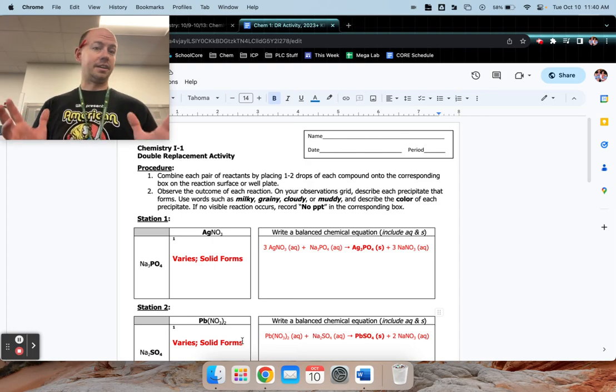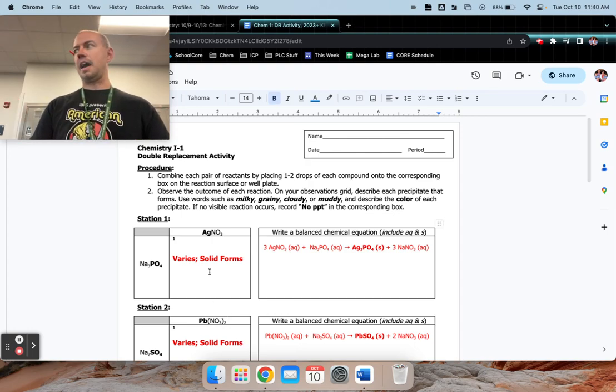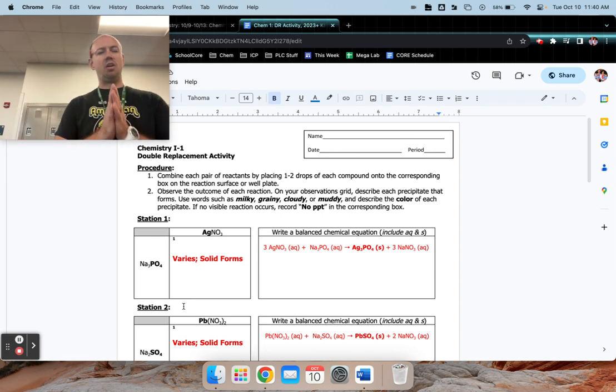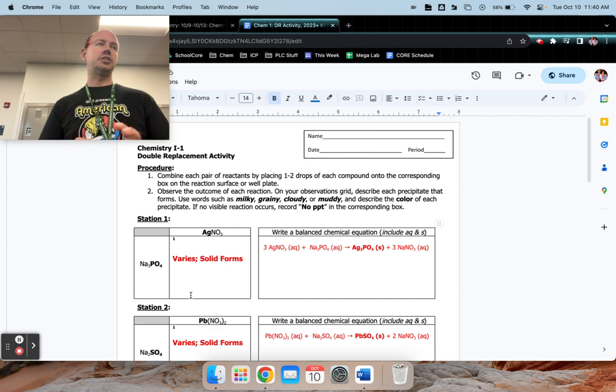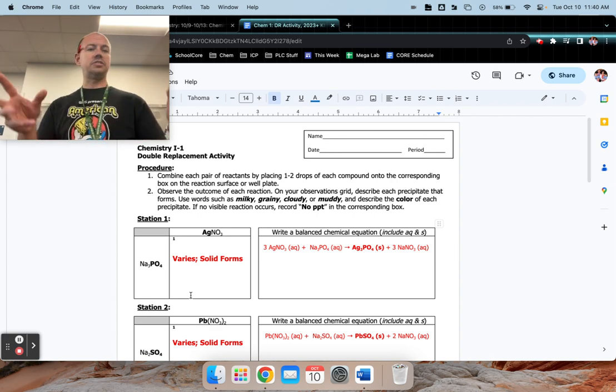Sorry I couldn't be here to do this, but we're going to look at the lab the same way you would have. This is something we would have done on a really small scale in the classroom. So here you're going to see slightly bigger reactions. I'm actually going to make the videos separately so that they can be shared not just with you, my students, but with any student who ended up missing the lab.